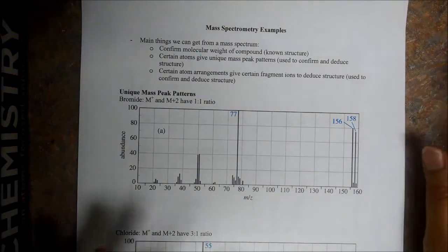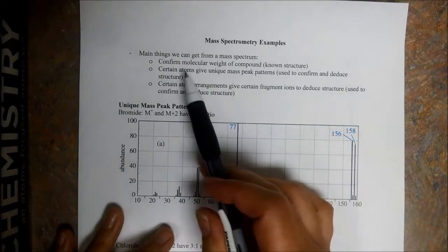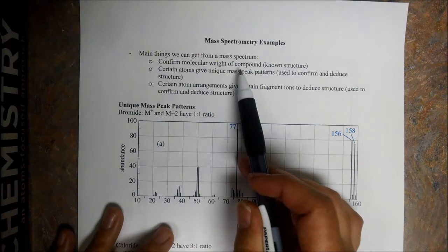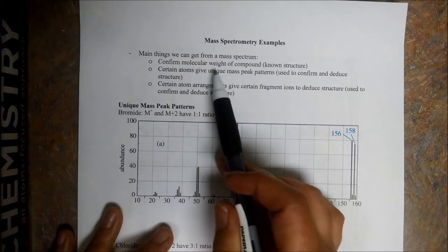So I would say there are three main things we can get from a mass spec, okay? First up, we can confirm the molecular weight of the compound. This is very useful if you make a new compound and you want to confirm that it is what you think it is. You need a mass spec for each compound.